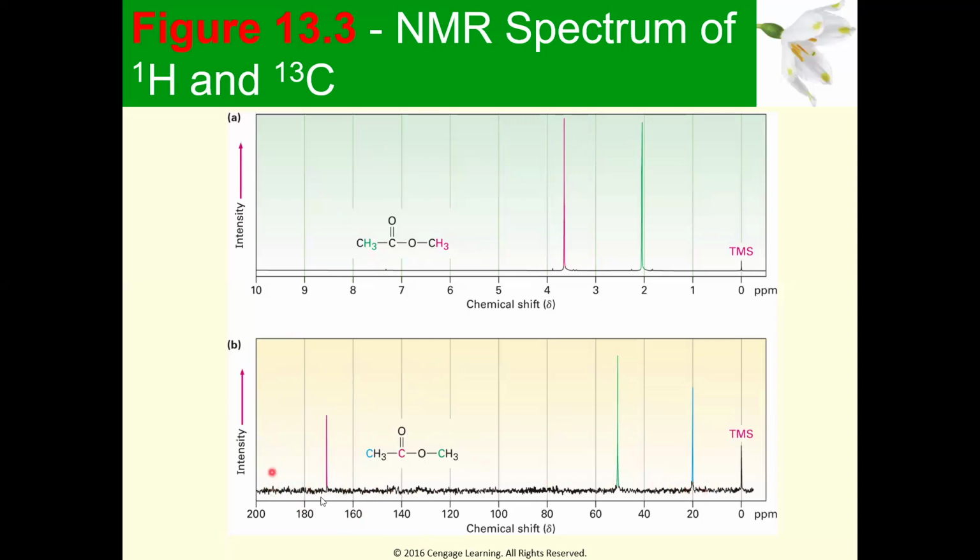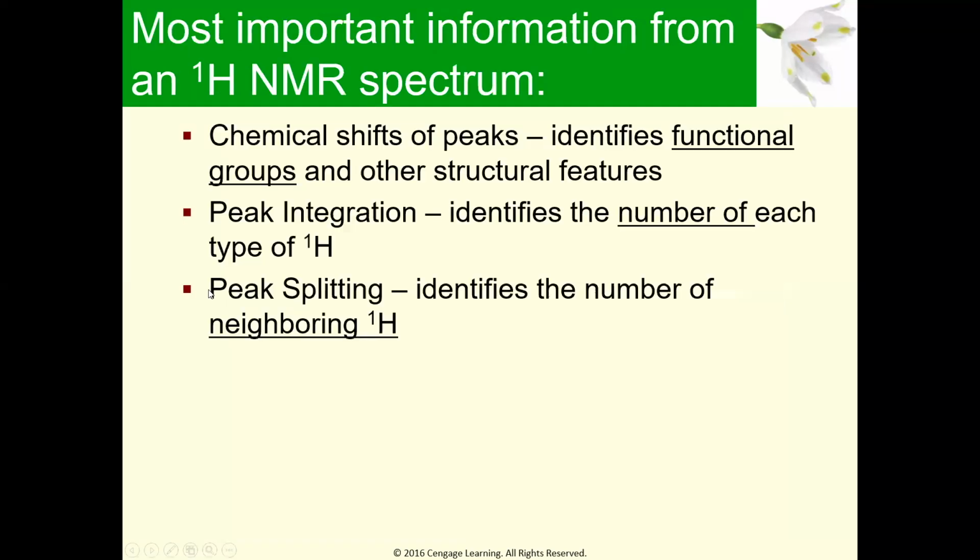Okay, so as I said, that's really all I'm going to point out about carbon-13 NMR today. If you take organic 2, you'll talk some more about that. Okay, now I want to mention the 3 important things that we get from NMR. And again, from now on, we're going to focus on proton NMR. And then we'll talk in more detail about each one.